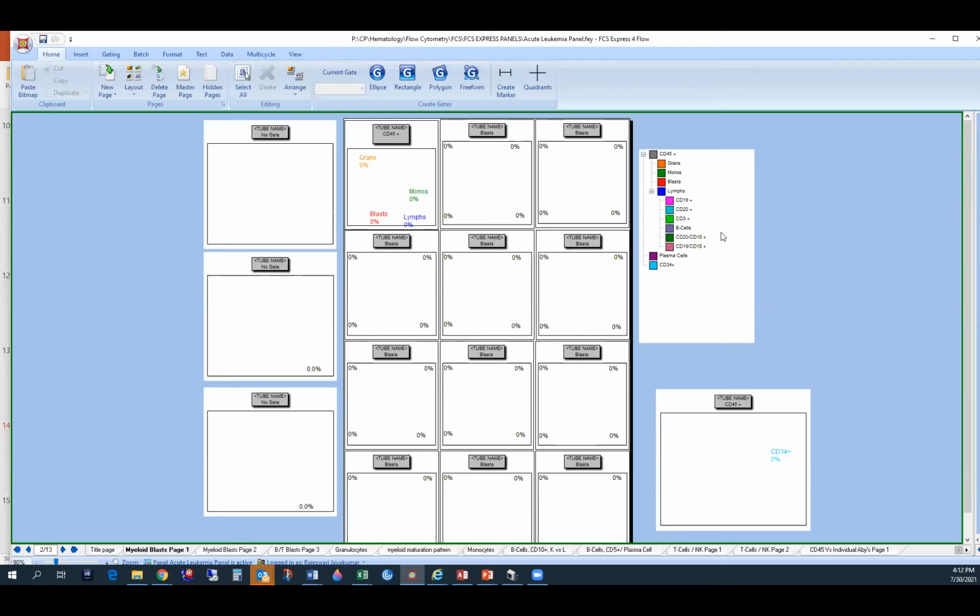The colors that we use for gating are what we give it after the raw data is out of the machine. So do not confuse that with the colors that we are actually talking about in the instrument. What we are indirectly implying is the fluorochromes, how many fluorochromes we can use in one run. That's what it means. So now Akansha will show you the gating, how it is done.